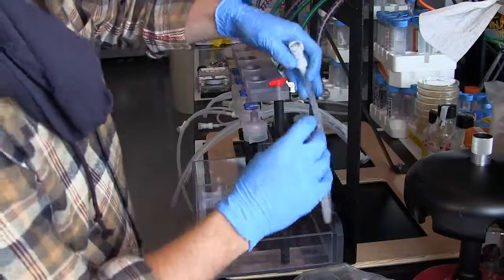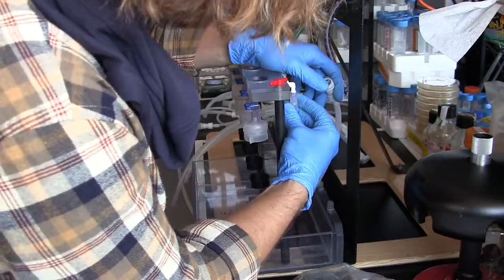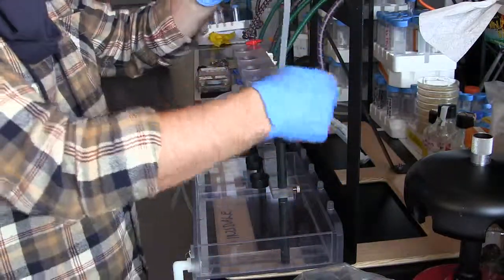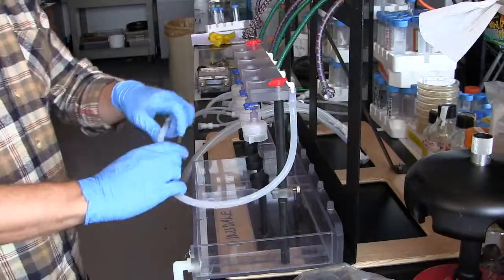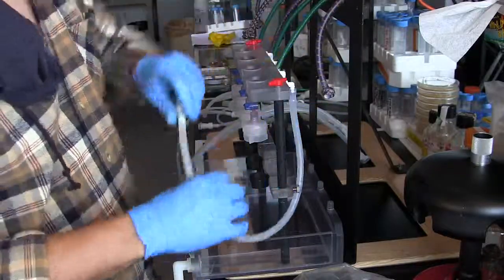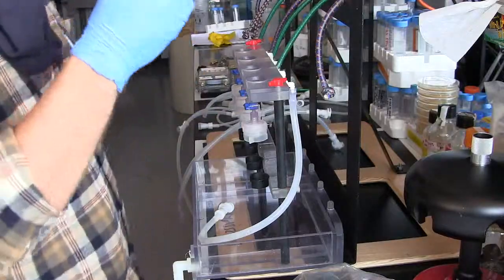What you have to do is you take the hose and then you put the luer lock fitting in and just twist it onto that elbow. Usually what I like to do is I leave this petcock end loose so that it can twist. If you clip it onto a Niskin and then go to tighten this up, you end up twisting the line. So always start with this line first. So let's just hook those up really quickly.